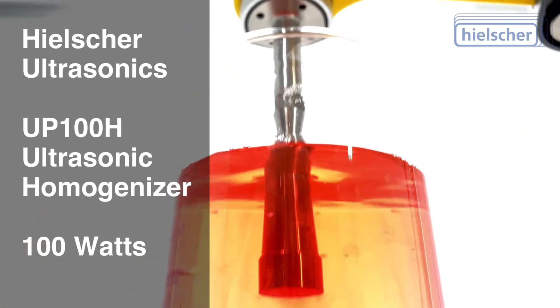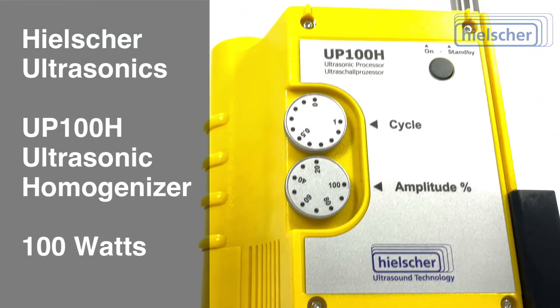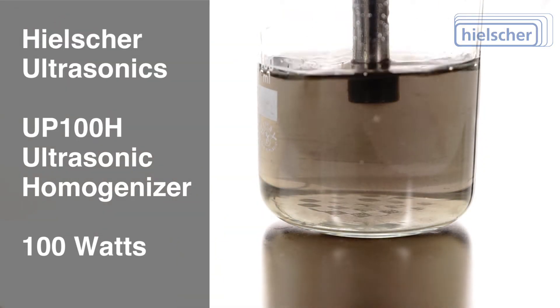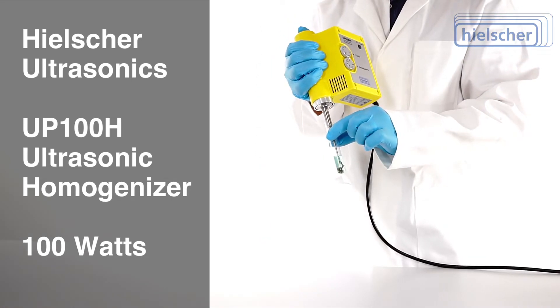The applications of the UP100H are versatile and make it a universal tool in every laboratory. Emulsification of oil and water or water and oil. Dispersion of CNTs, graphite, pigments, or nanomaterials. Cell disruption before analysis.